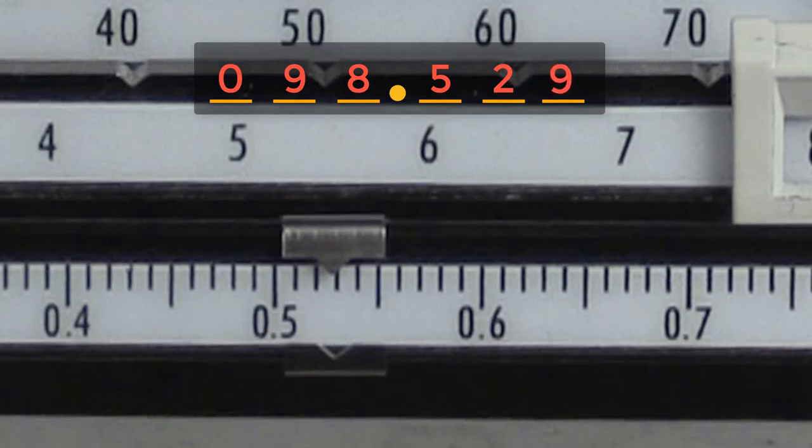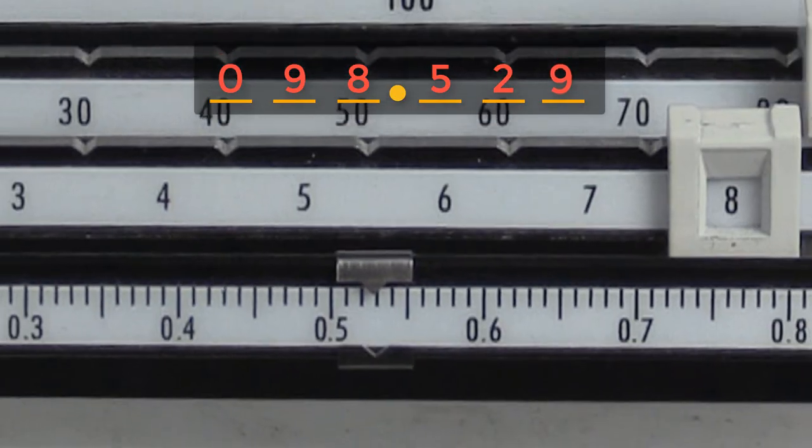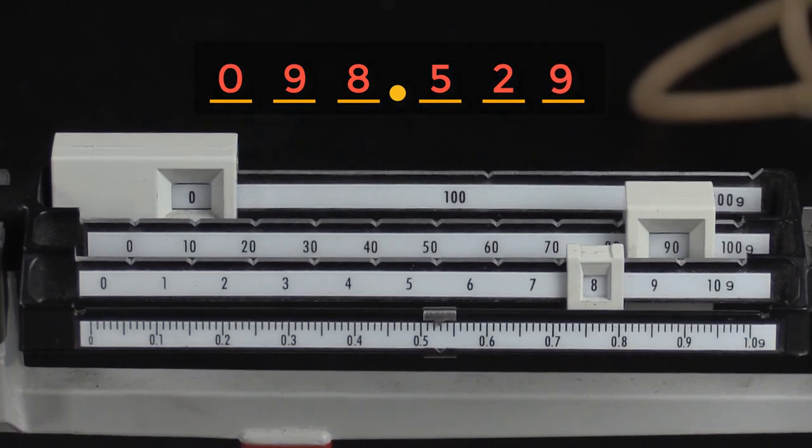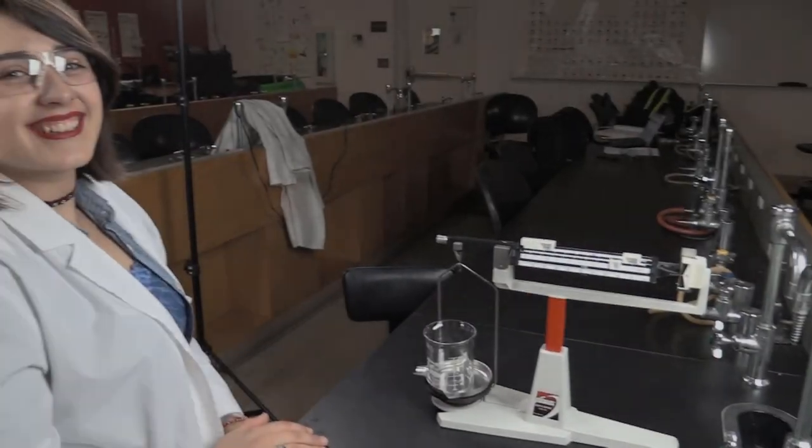This last digit is our doubtful digit, and is the result of the inherent uncertainty in this device. This measurement has five significant figures and three decimal places. Thanks, Ileana.